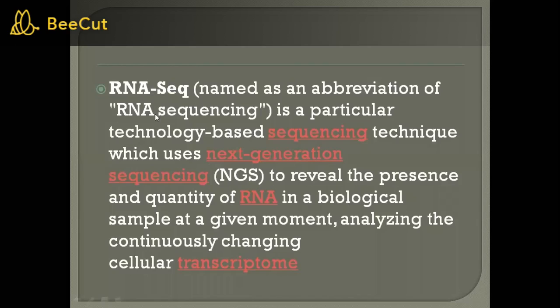So what is RNA-seq? It is an abbreviation given for RNA sequencing, and this is a technology-based sequencing technique which makes use of next generation sequencing techniques. Next generation sequencing sequences the RNA molecules, so that it will reveal the presence and quantity of RNA at one moment.